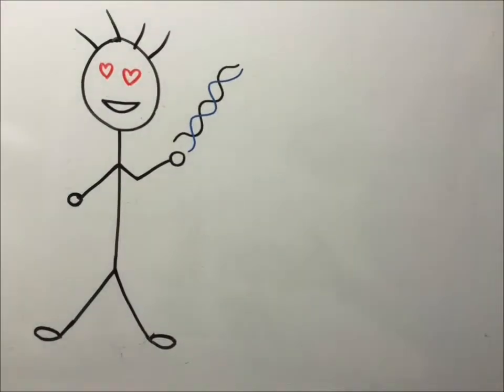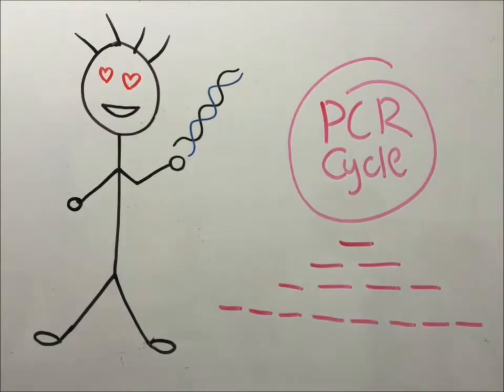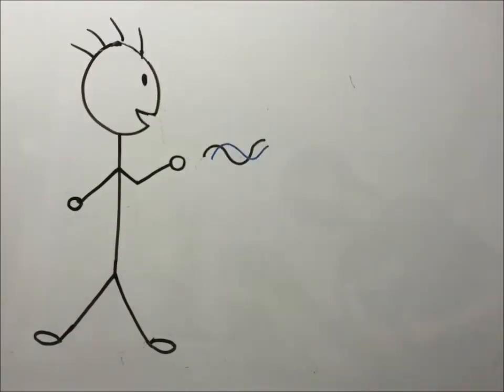Tom loves how qPCR combines the exponential synthesis of thermocycling with simultaneous fluorescence detection, with the amount of product generated at every cycle being proportional to the amount of starting template, as well as the components found in a normal PCR mix.